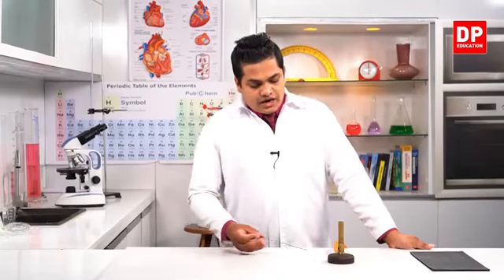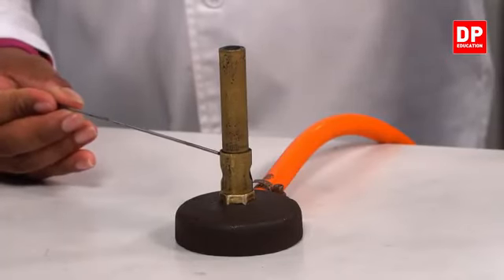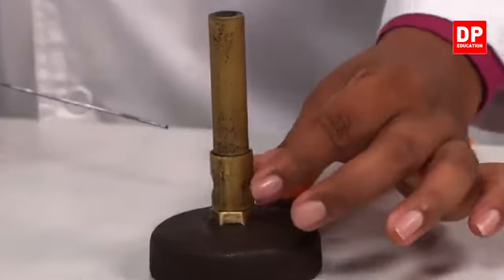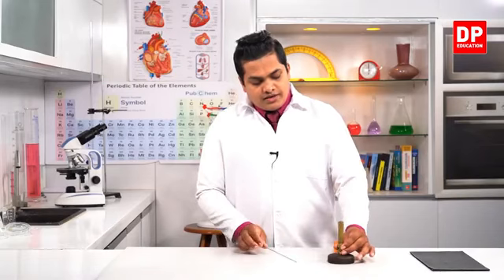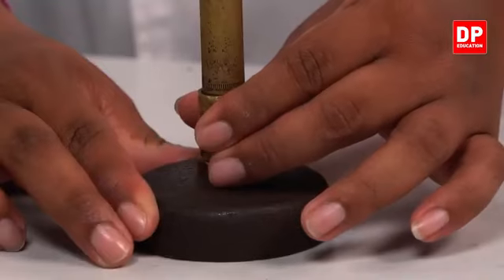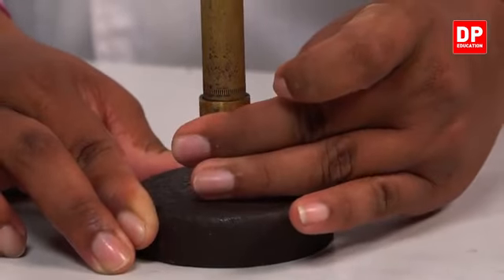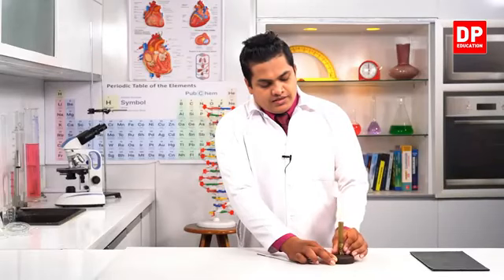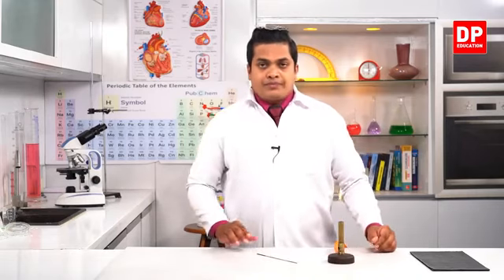And after the base, you can observe there is a collar. This collar can be turned here and there. When turning the collar like this, you can observe the change of color in the Bunsen flame.